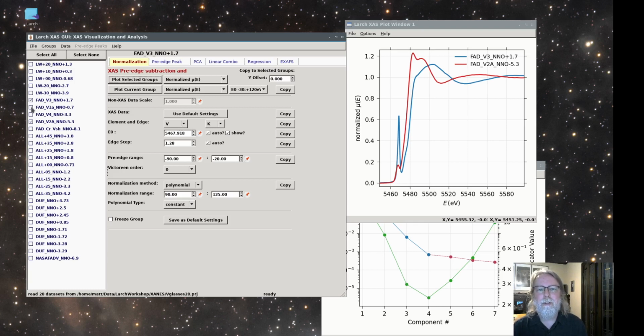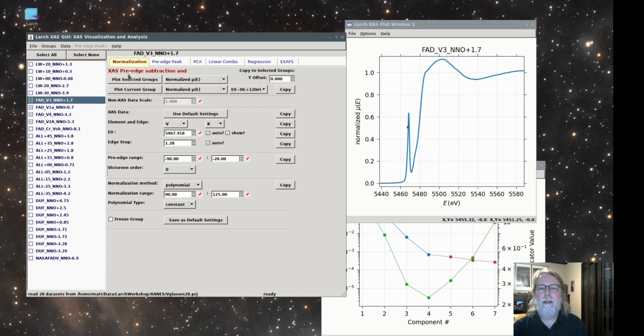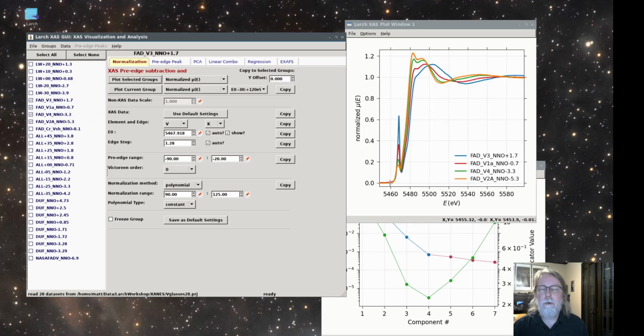And one of the questions then is, can we infer that from the XANES data? That's one of the most pressing questions for doing XANES analysis in these kinds of samples, learning what the fugacity is. And you can certainly fit the pre-edge peaks, get out the oxidation state, and then map that oxidation state to fugacity.